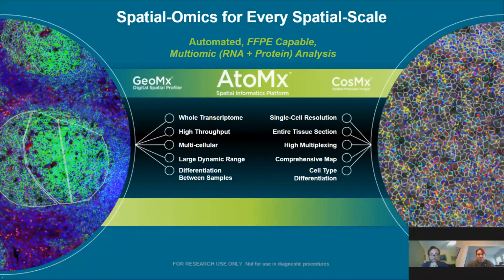One of the questions that came through is, can you do spatial transcriptomic and proteomic profiling with GeoMx from the same tissue section?